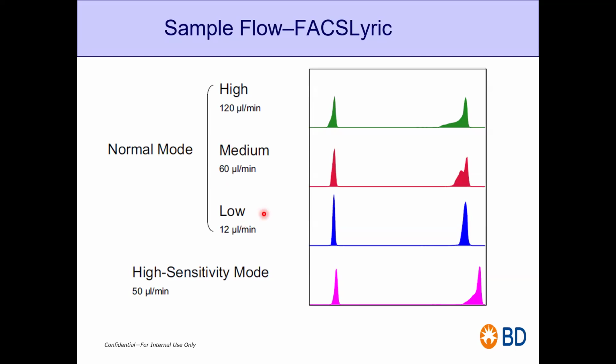But let's say you have a population where you can't play with your resolution and you need high resolution, meaning your negative should be separate and your positive should be separate. This comes up in the case of cell cycle, where it is very important to resolve your population. Why?